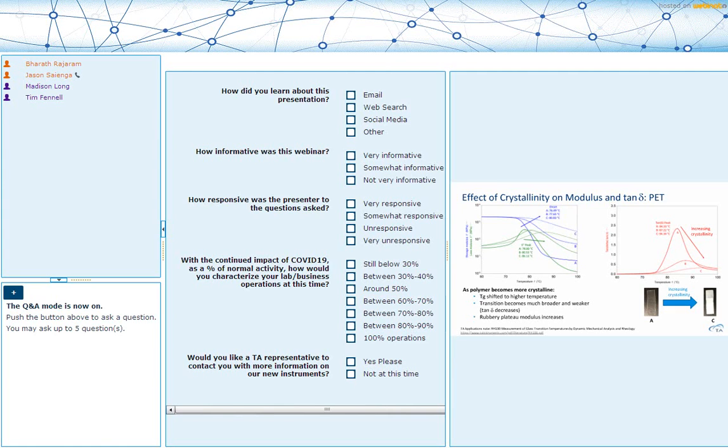Sure. So TTS is a technique that is very well established in rheological literature. There are several publications that have gone in depth into detail on this topic. And TA has application notes on this as well, but there are also many peer-reviewed publications that are available. As a technique, it works, but we have to be careful when applying TTS. It works under some simple conditions, but there are a few cases where it should not be used.